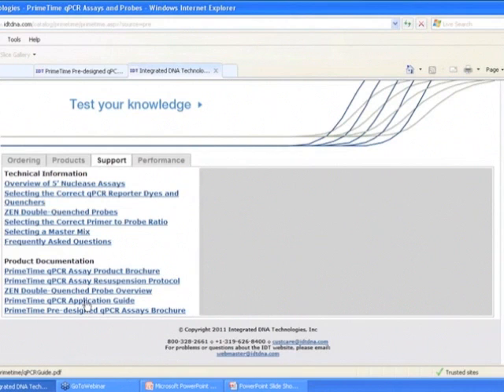What we'll be able to do is this webinar will be available as a video, so if people want to just scroll through and have a look at the end, they should be able to see the web link there. So that's great that you've got that there. Okay, so coming back to a question: how do I decide what combination of fluorophore dyes I need for multiplexing?